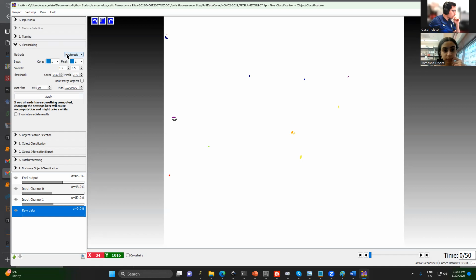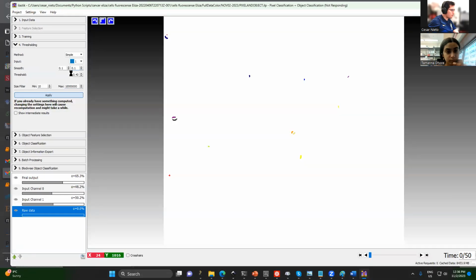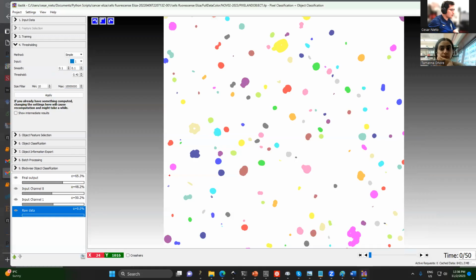Range. Because here I use the blue as background and yellow as okay. Now it makes more sense. What if I do this?